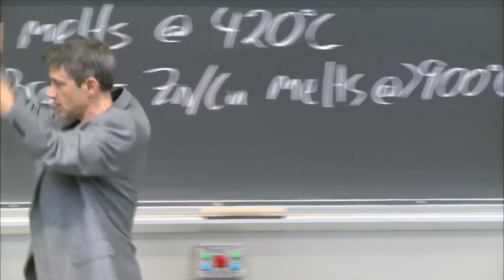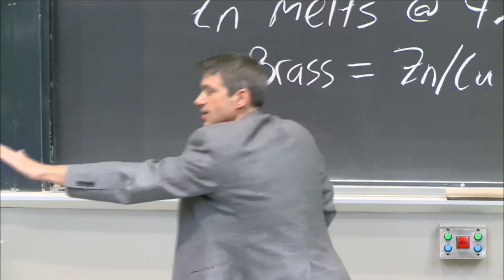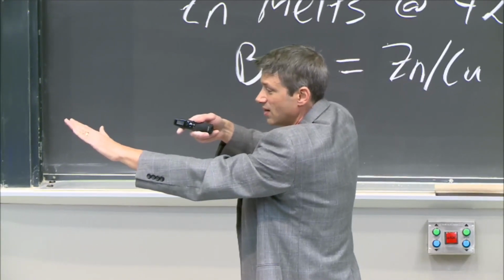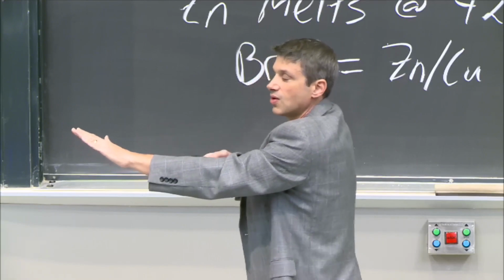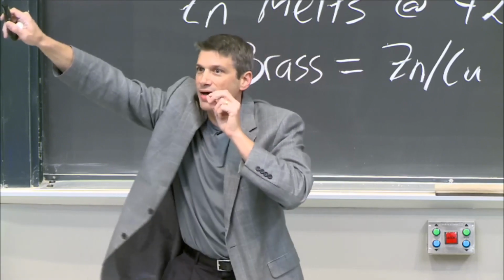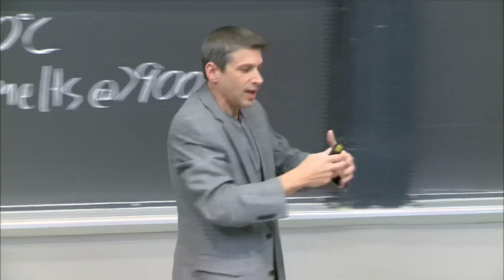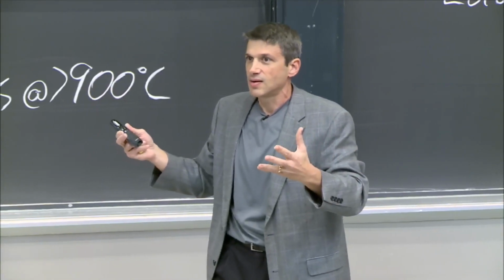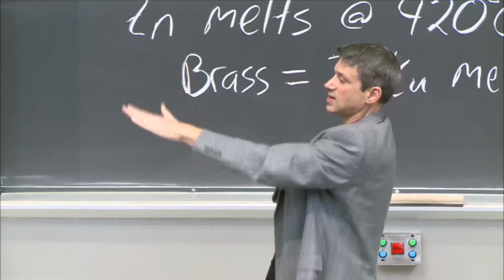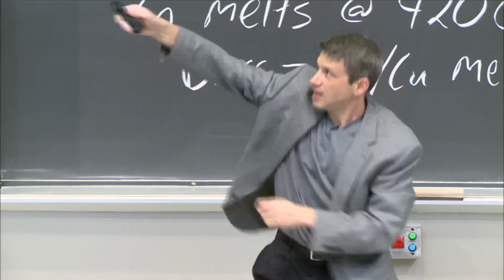But if I'm looking at the crystal and it's fixed, I'm going to see there's also another set of planes like that. You see? And if I'm a different wavelength, not the same one, I might constructively interfere with those. But you can see that the angle that I make would be different, and so I'll put a spot in a different place. So I've got all the wavelengths there, and as they constructively interfere with different planes that they see, they make different spots. And that's what those are.